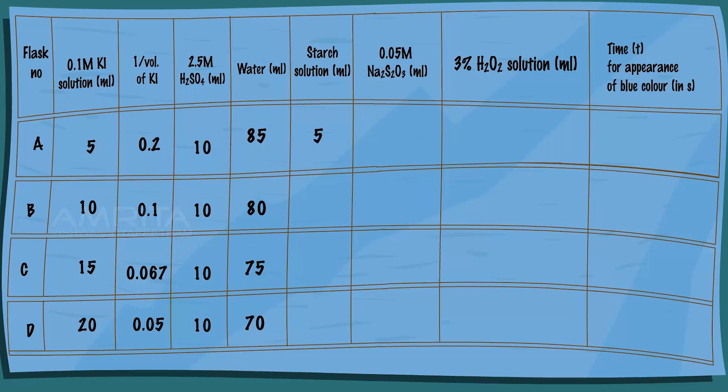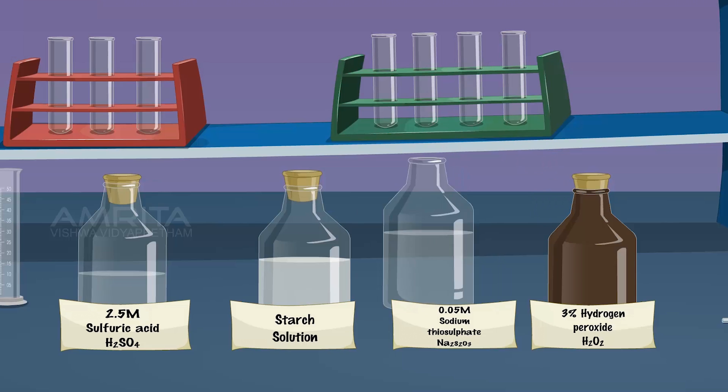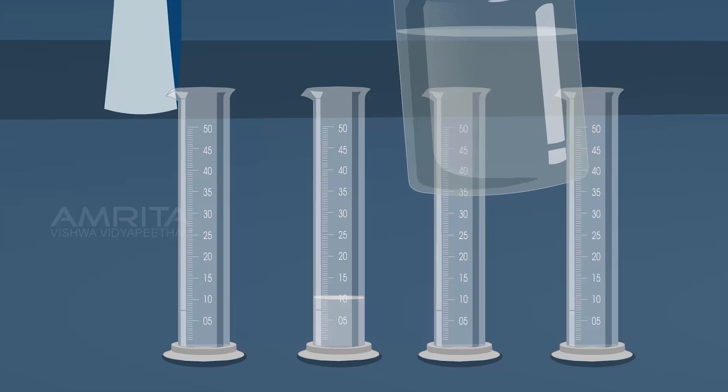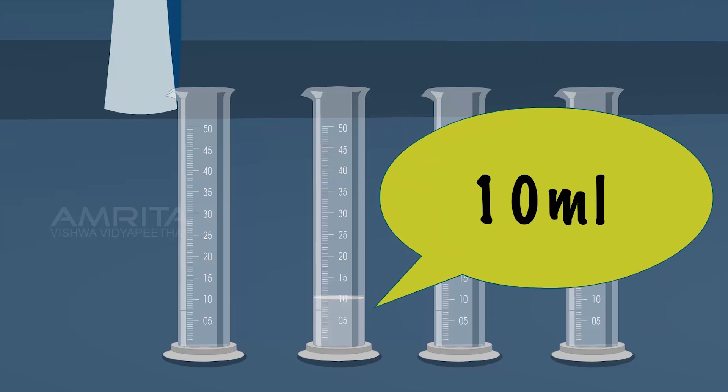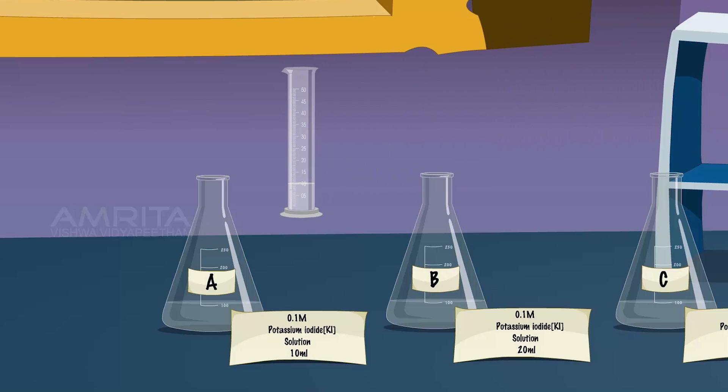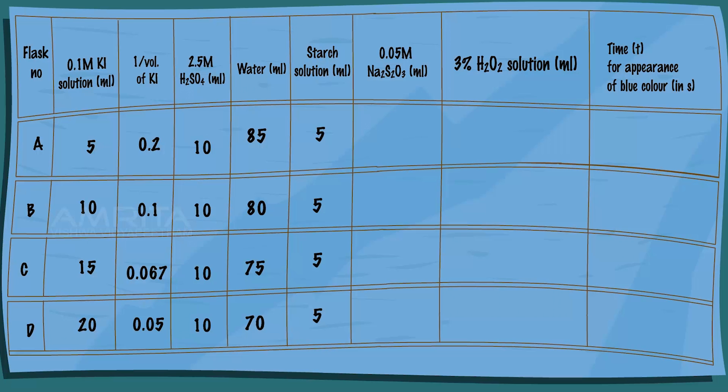Repeat the same procedure for the remaining flasks. Then take 10 ml of 0.05 molar sodium thiosulfate solution. Add it into flask A. Repeat the same procedure for the remaining flasks.